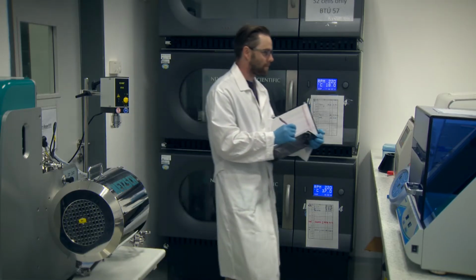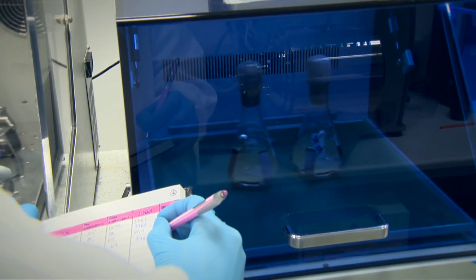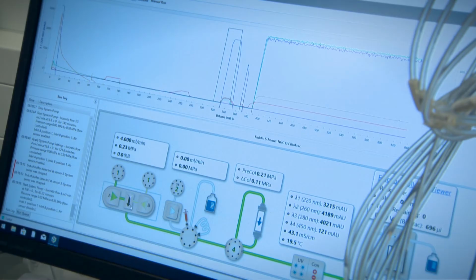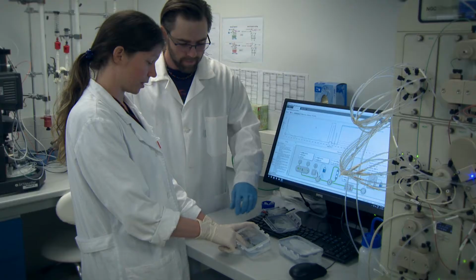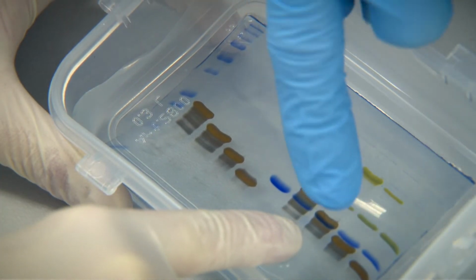The process starts in the laboratory, where cell cultures are grown and thereafter provide studied proteins. Most of our experiments require an active and highly pure protein. It's obtained from a cell suspension by way of purification that uses high-performance liquid chromatography methods.